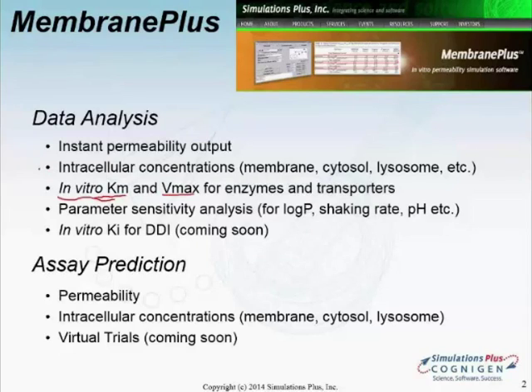But also getting information on where the drug is getting distributed into the cells, looking at the membrane, intracellular concentrations, trapping in the lysosomes, and so on.